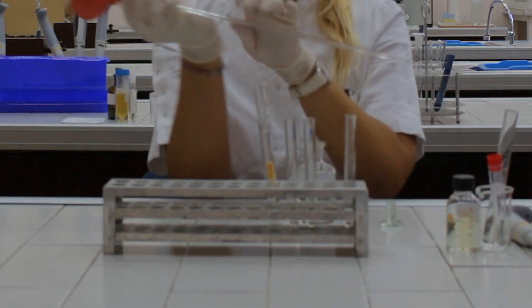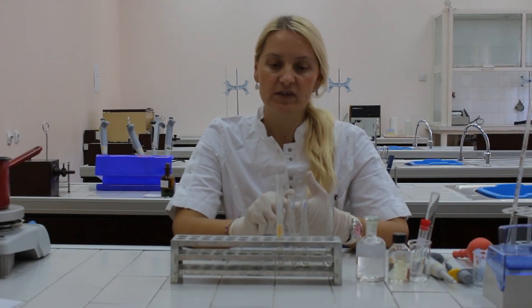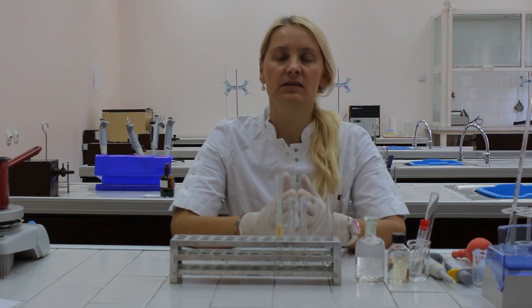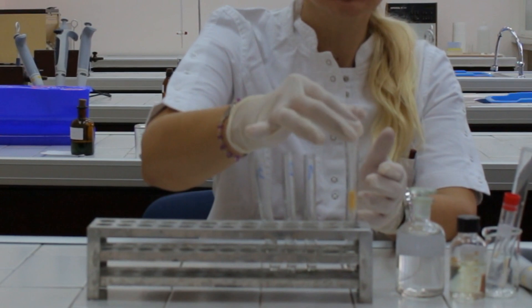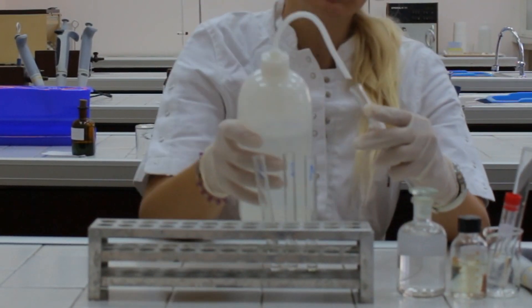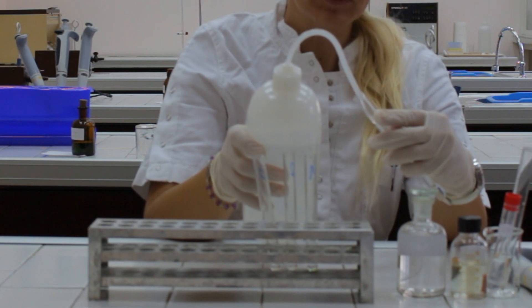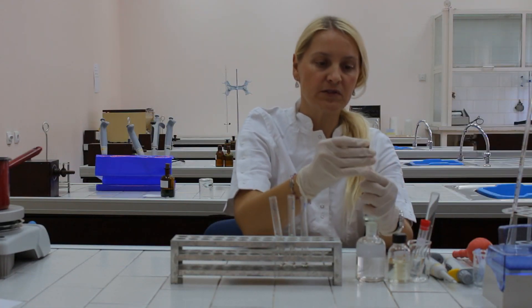Wait for the solution to flow in. When the solution of acetic acid is completed into test tube number three, we should return our chromatographic column to its initial test tube, fill it with distilled water, and put a stopper on.